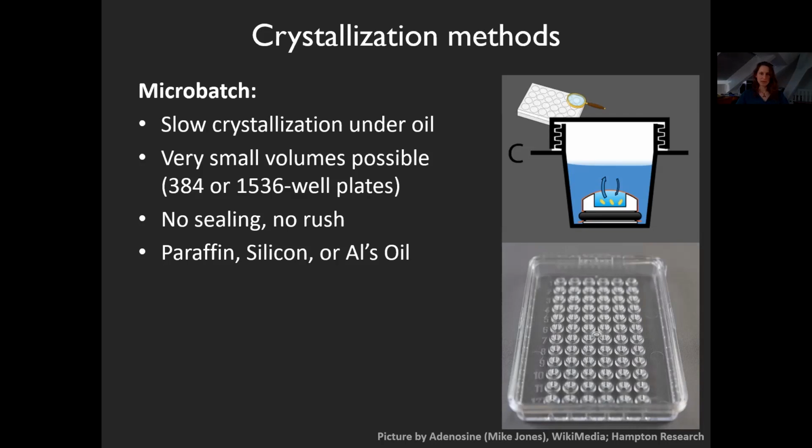Evaporation happens here slowly because the oil keeps stuff from evaporating. What is very nice about this method is you need very little material. You don't need to seal. There is no rush. It's not like a 96 sitting drop plate which needs to be glued shut as quickly as you can, because under the oil nothing happens anymore. So you have all the time in the world to pipette that thing. And I think it's an underestimated method.